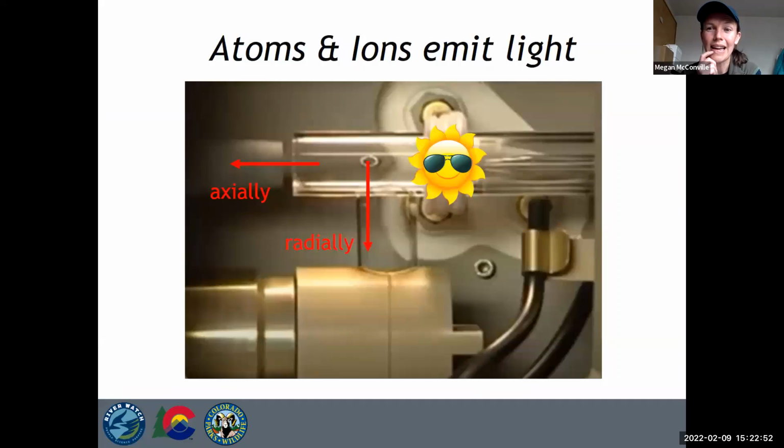So we're creating ions, so charged particles. Basically, every atom, when you heat it to a certain frequency, there are these outer shells of electrons, right? At some point in your courses, you maybe have gotten there or you may get there, but there's this excitation of these electrons, and these outer electrons actually leave, creating instability in your source.